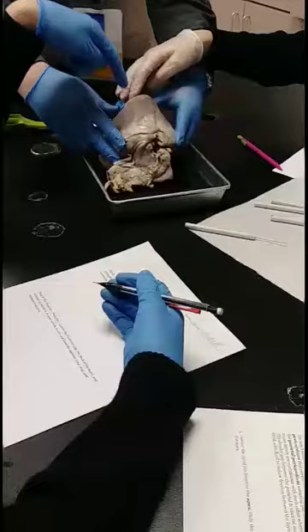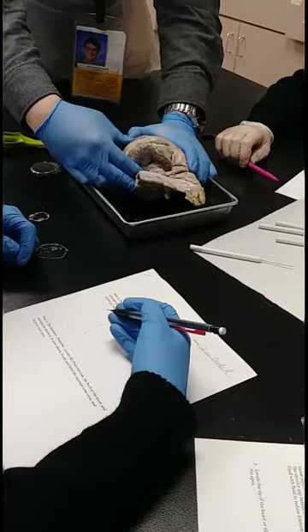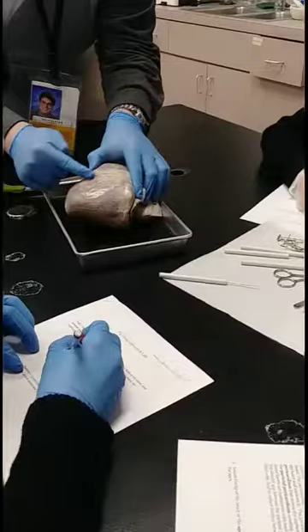Other side. So there's a heart there. Sometimes the heart is damaged, I don't know how they collect it, but this is just a little hole. That's all it is. Make sense? Okay. Interventricular groove.